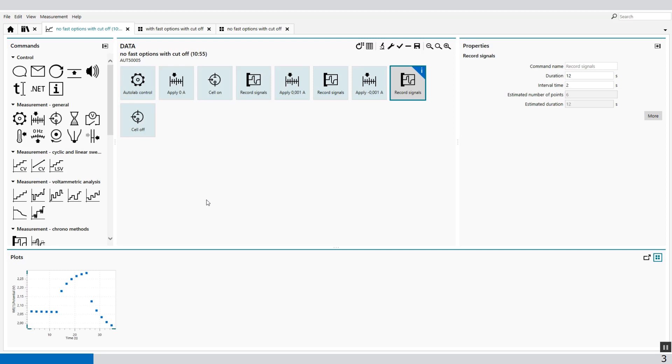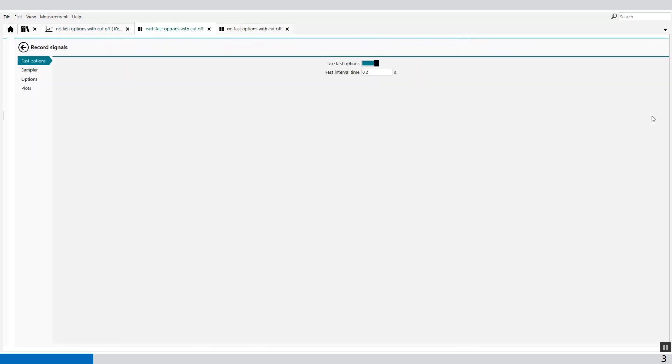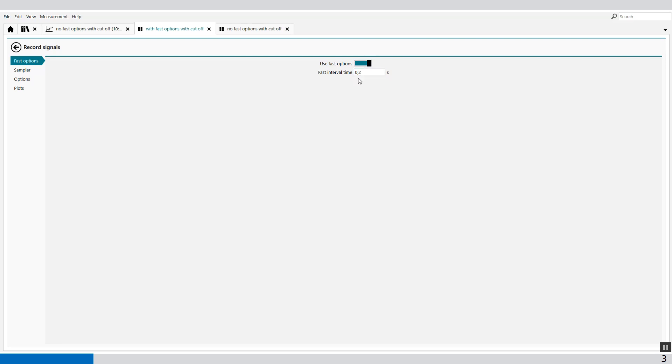We can use the fast options. If we look at the record signals and go to the more, then we can enable the fast options command.